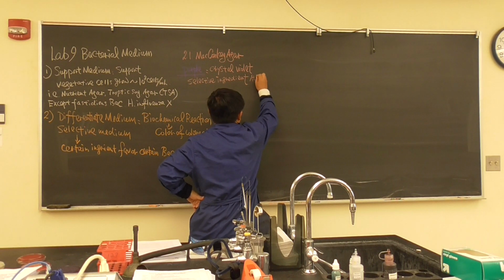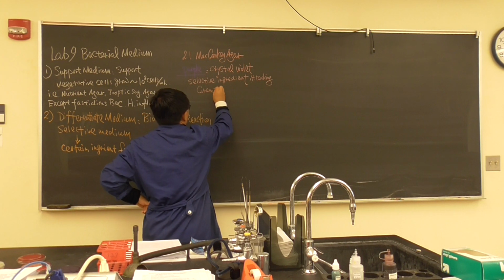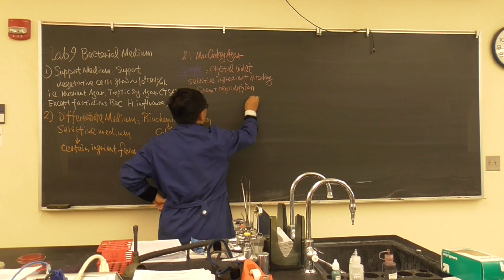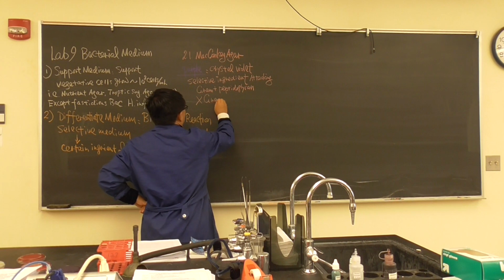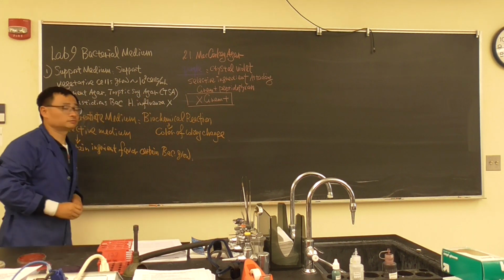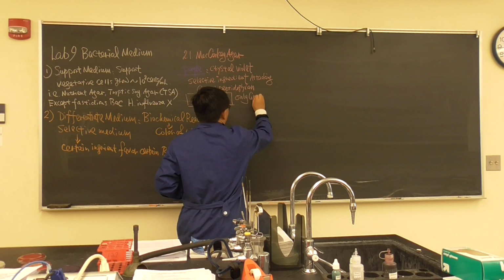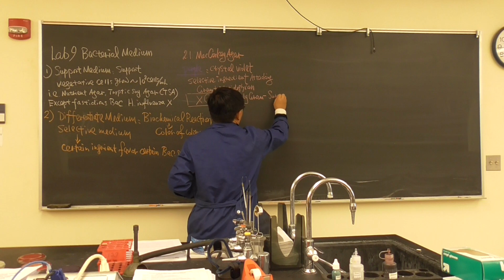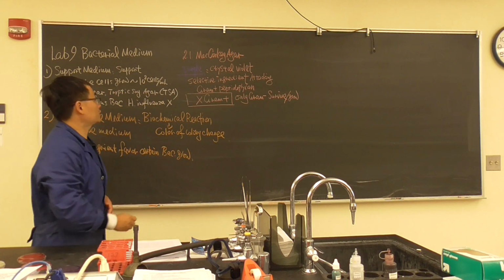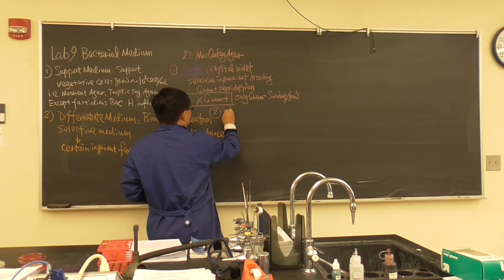We'll say attacking gram-positive bacteria, peptidoglycan. So, gram-positive bacteria will not grow. This is very important information. Okay? Only gram-negative bacteria survive. Well, you can say grow. So that's very important information. It's a selective media. Second, this is a differentiated media.